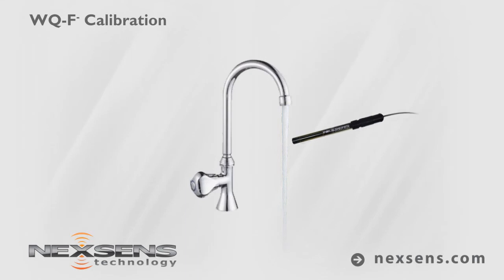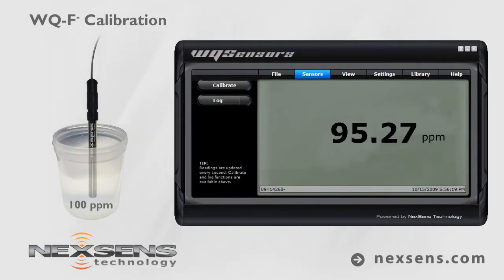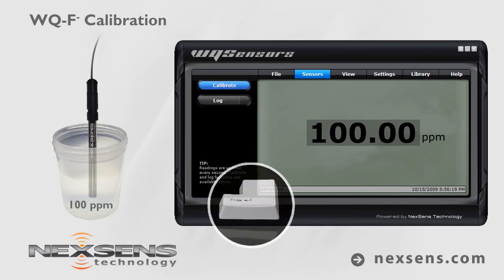Rinse and shake off any excess water. Submerge the probe in the 100 parts per million standard. Wait for the reading to stabilize. Adjust the value to 100 parts per million and press enter.